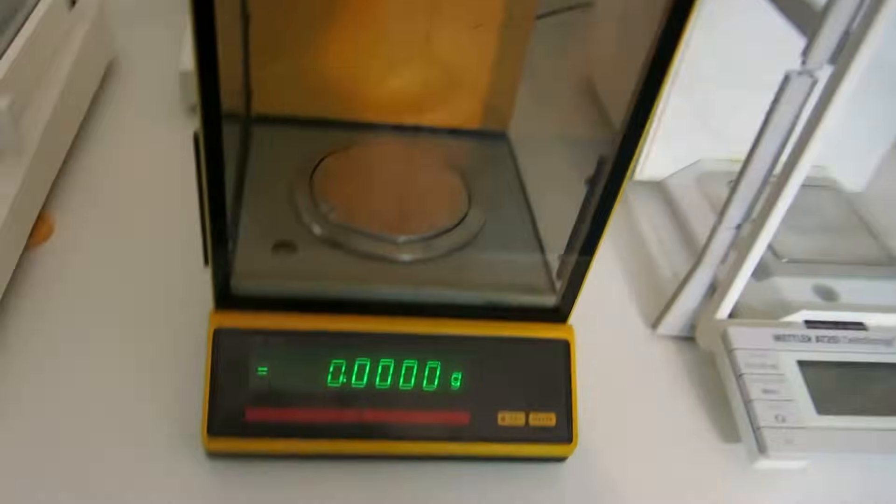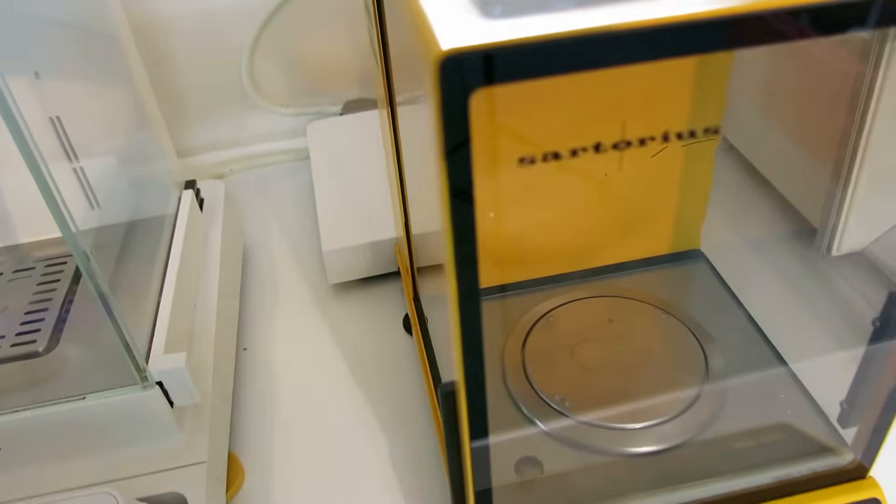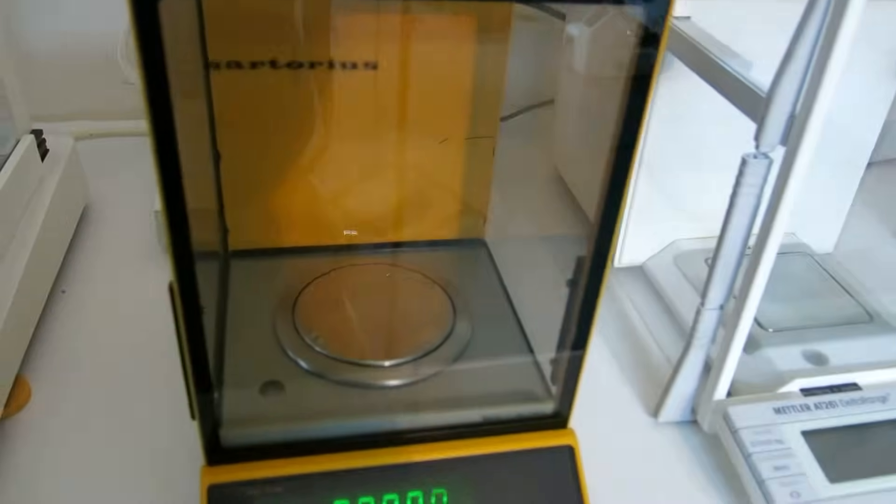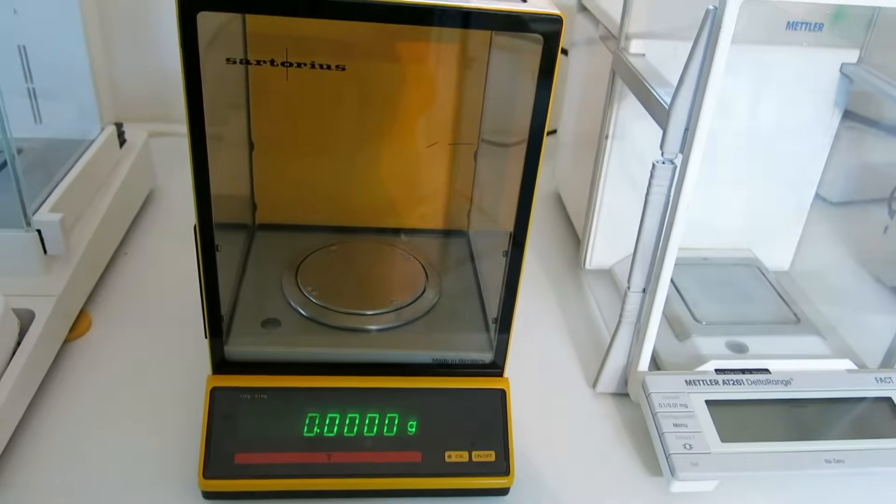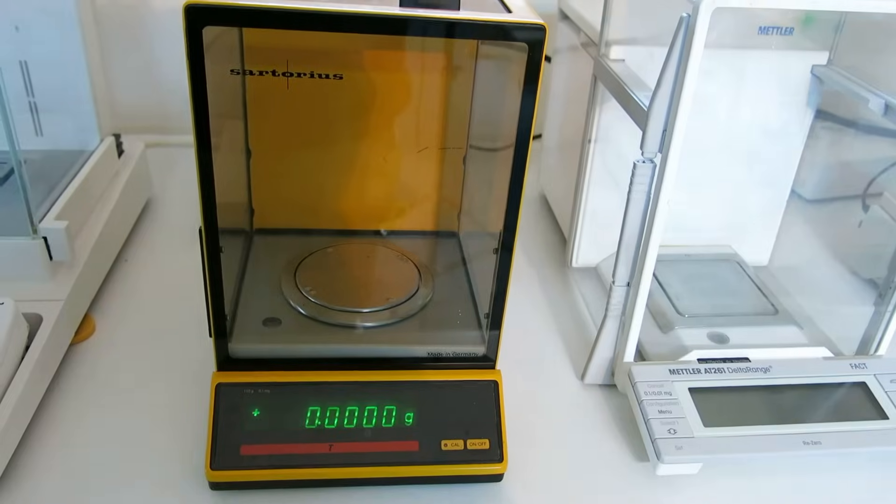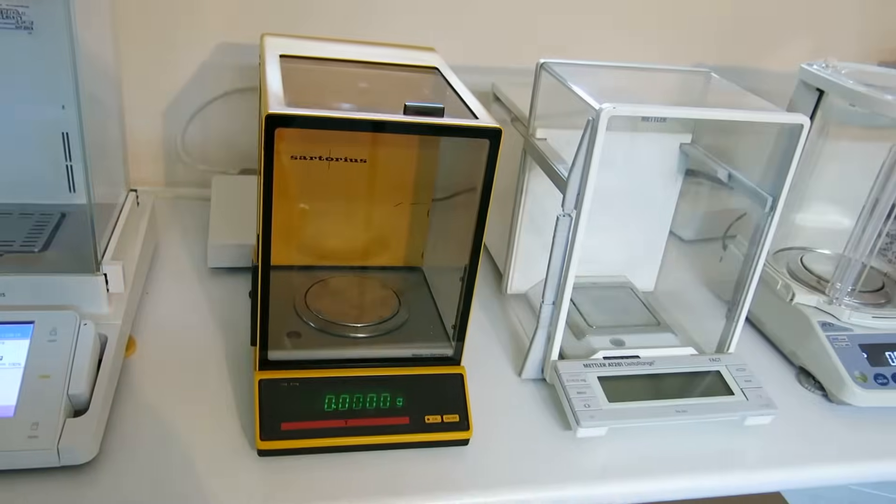Moving back to an old faithful. Of course the old Sartorius. This is the older. This is 110g to 0.1mg. Please be aware that we're on a suspended ceiling here. So when I'm moving around it is affecting the balances. We're on a mezzanine. Just some point of fact.